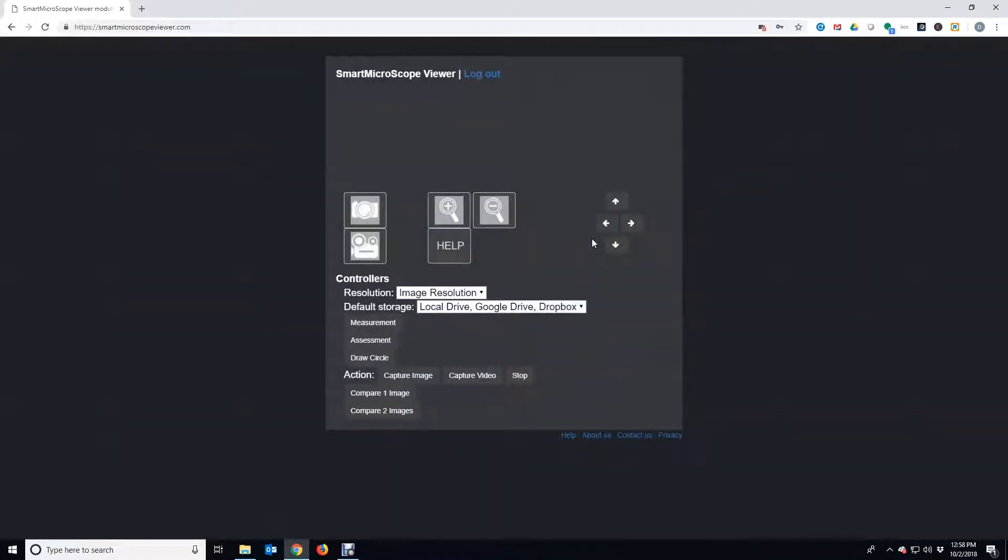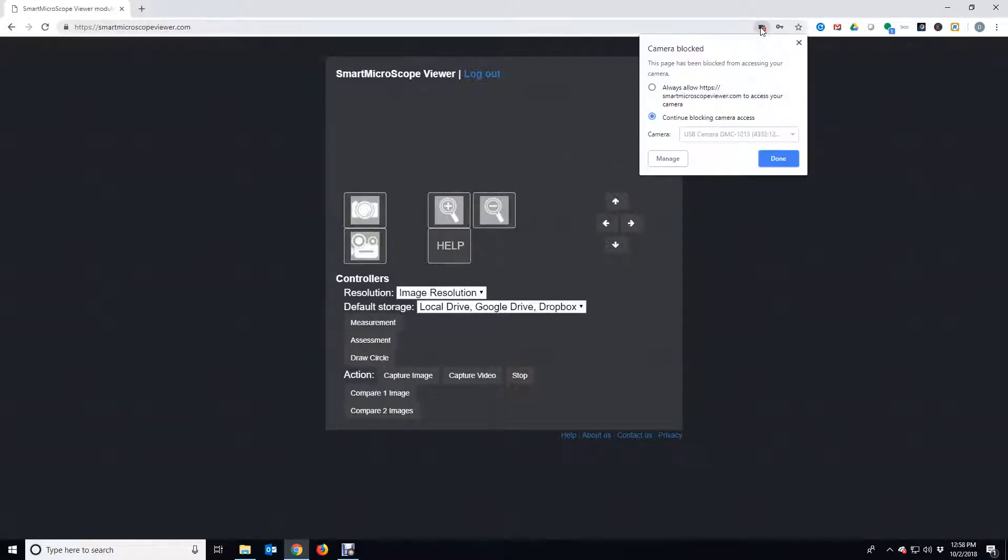The first time you log in, you will need to allow use of your camera and set it as your Smart Microscope. Click the Camera Settings icon and make sure that Allow is selected and click Manage.